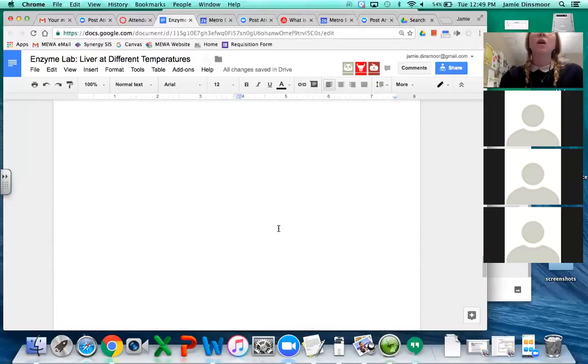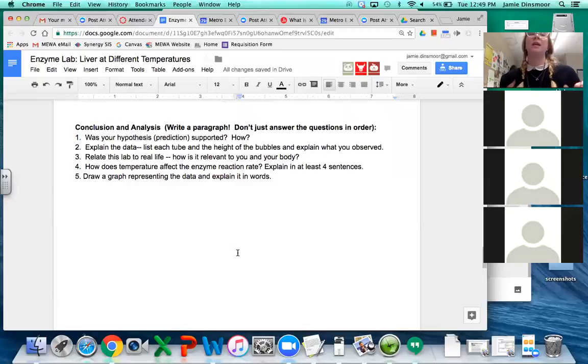And then other than that, you're gonna be making a graph. You can do the graph on the computer. You can do it on paper, right? Perfectly fine. And then you're explaining how temperature affects enzyme reaction rate, right? That's really the part where you need to use vocab. In terms of reactions, it looks like our body temperature is still going, right? Just a tiny bit. There's like one bubble per second going here. So I would say body temperature was the longest.